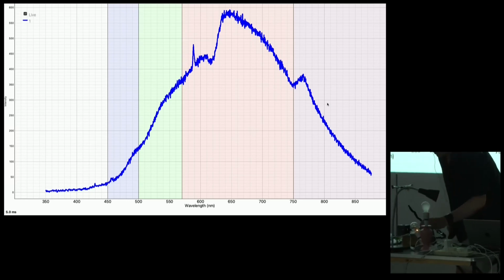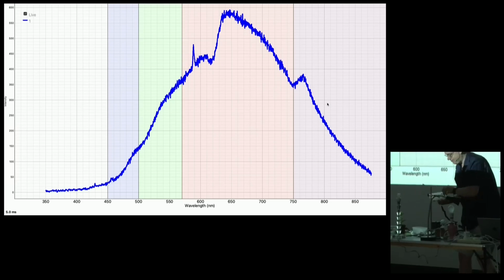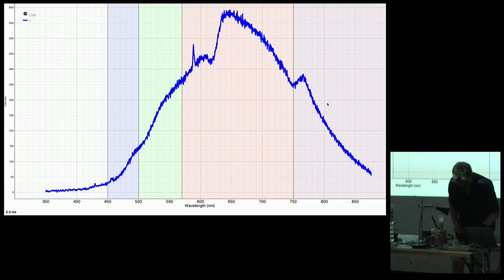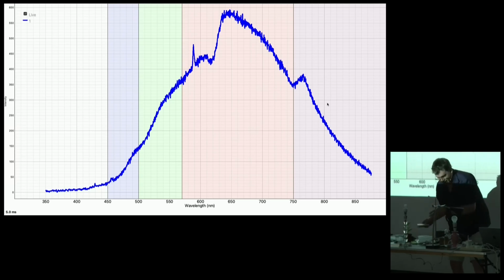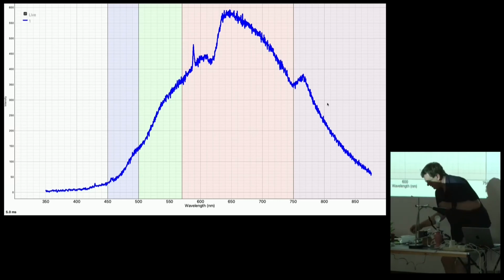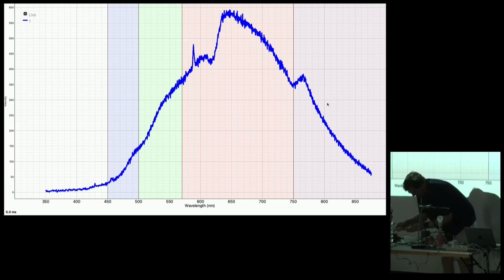We're then going to take another candle that I have contaminated with a mystery substance. Not food colouring either, in fact. So here is a candle that I have contaminated. Let's light that. Whoops. There we are. Oh, it's gone out. Of course it has. Let's go back to the previous candle and contaminate it live on stage.